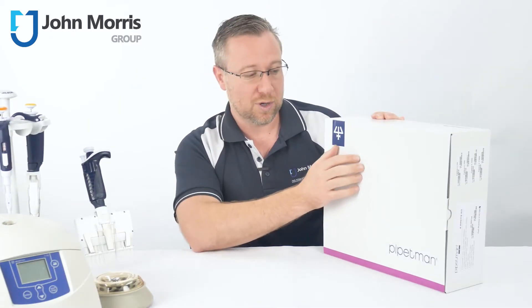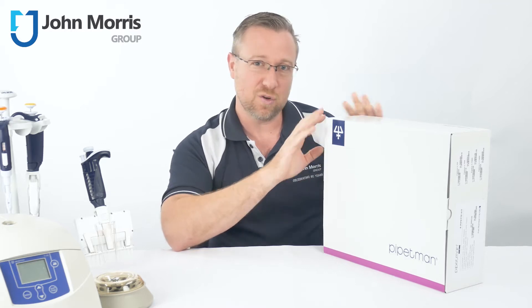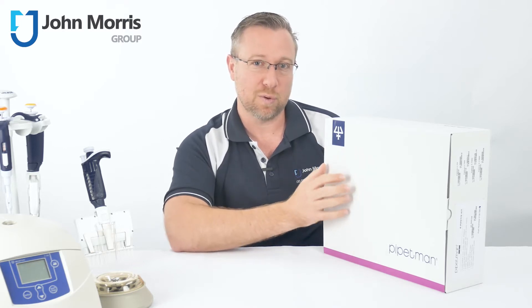The first thing I want to point out is the box itself is made out of recycled cardboard and it's actually very thin. You'll notice it's also not covered in plastic, and Gilson have done this to make sure it's as environmentally friendly as possible.